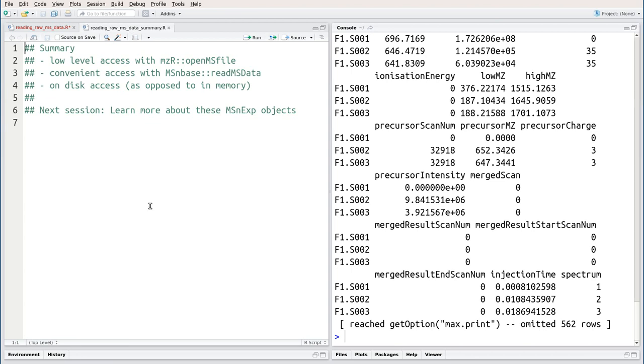As a summary, what we have seen in this session is we've learned about low-level access to raw mass spectrometry data with the OpenMS file function. We've also learned about much more convenient access with readmsdata from MSNBase. And we've learned that these two functions provide on-disk access as opposed to loading any data into memory, which is much more efficient once we analyze bigger datasets.